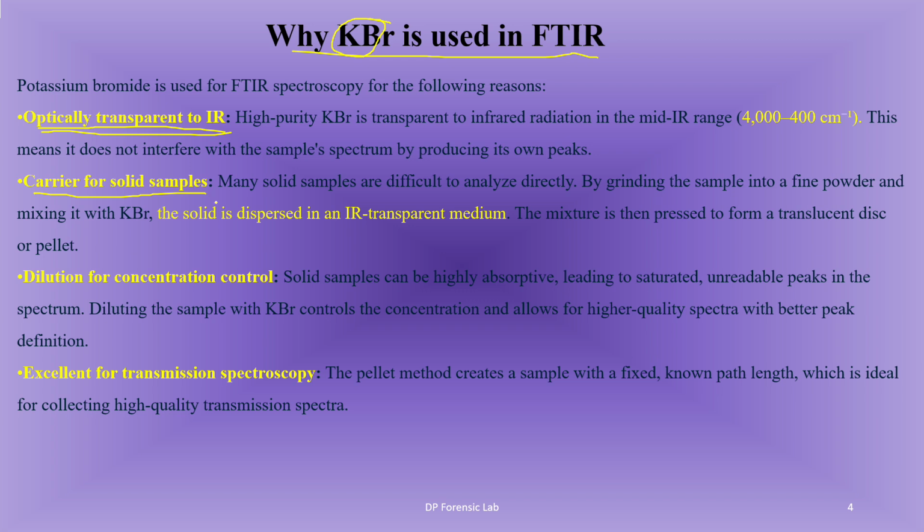Second, it is a carrier for solids. Many solid samples are difficult to analyze directly, so the sample is ground into fine particles and mixed with KBr. The solid is dispersed in the IR-transparent material. KBr powder holds the sample and dilutes its concentration.